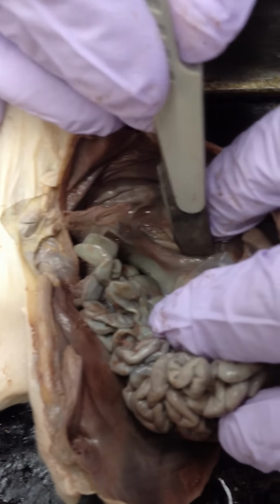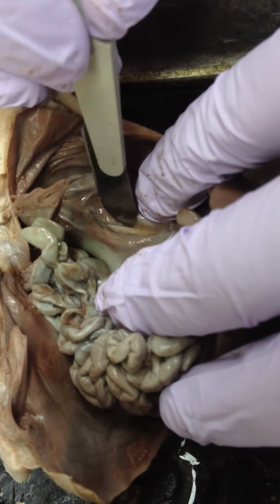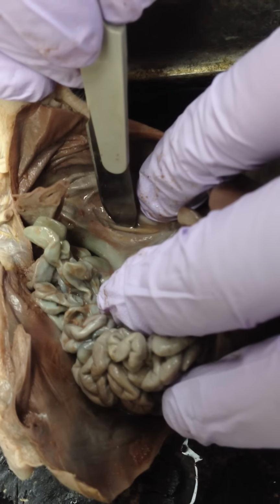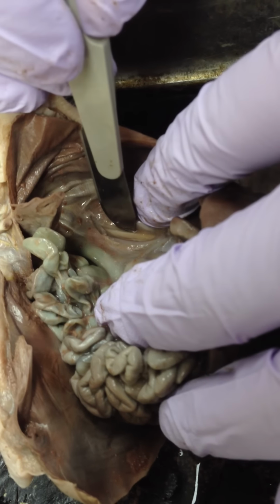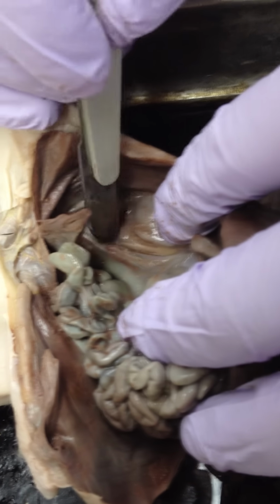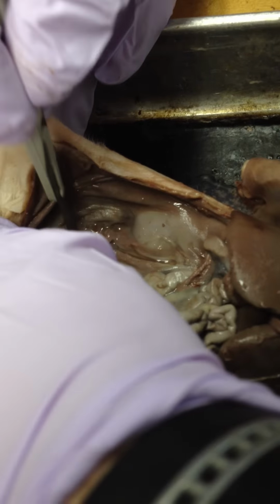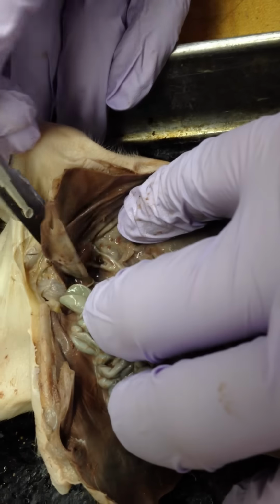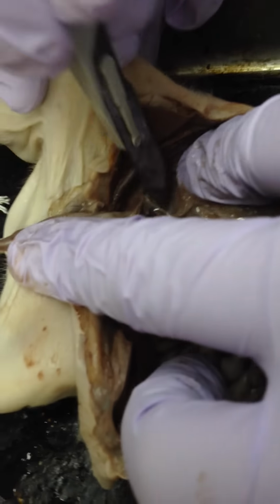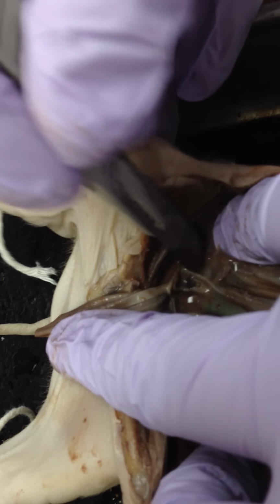Oh, there is the ureter. So that's the ureter right there, and it's kind of thick. And then it just runs all the way down to the bladder, which I think is the big guy right here, like where I cut it. This part right here, that's the bladder.